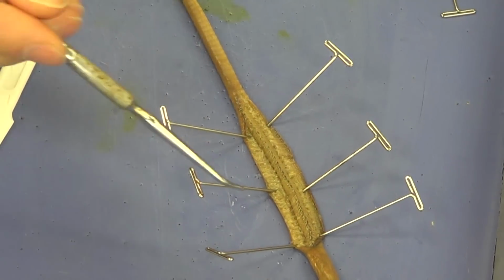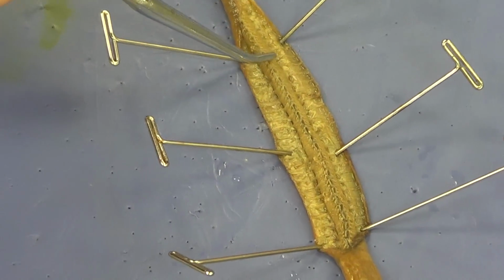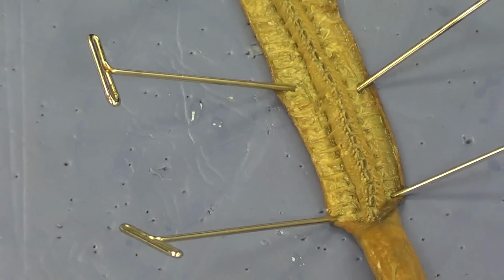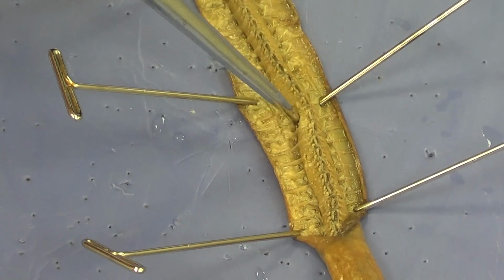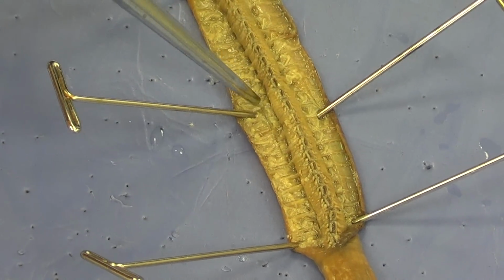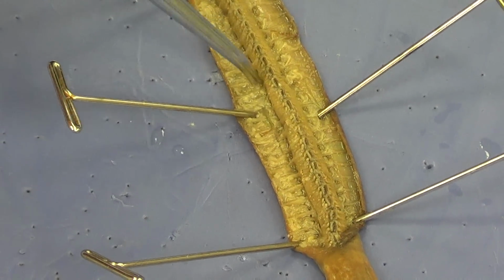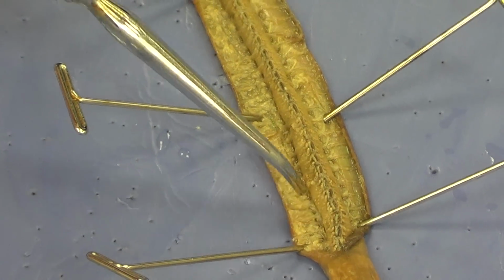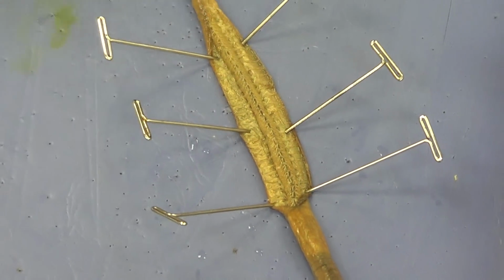And we can see this dark structure begin to appear on top here. This dark structure right here is the dorsal blood vessel. That's the dorsal blood vessel. The space between the skin and the intestine, this is the intestine, is going to be called the coelum. And that coelum is our space, our body cavity. And that body cavity, or coelum, is going to be divided into compartments by the septa I was cutting through.